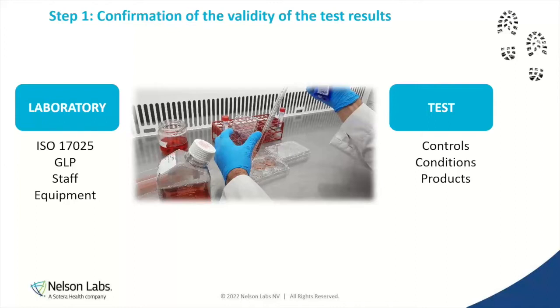And I think you should doubt at the beginning: am I in the right room? Should I be entering here? I'm not sure. Audrey, what are your thoughts on it? Should you question the results? I think as scientists, we have to always say yes to that. Not that as a lab we think it often comes up, but it's the first starting point. Why go down the road of investigating a failure if you're not confident in the data? So always start, verify the data, make sure it's correct.